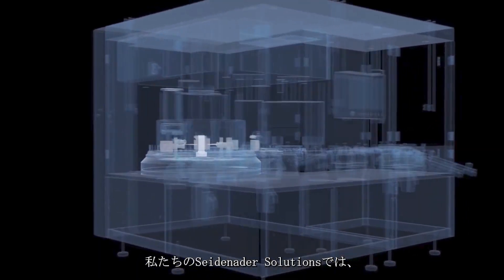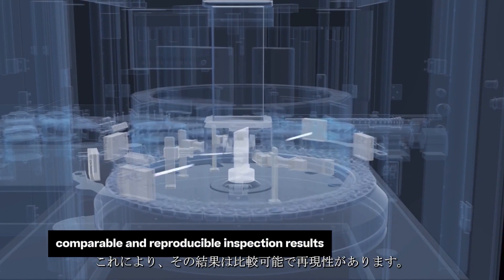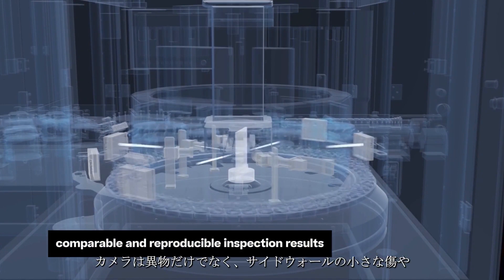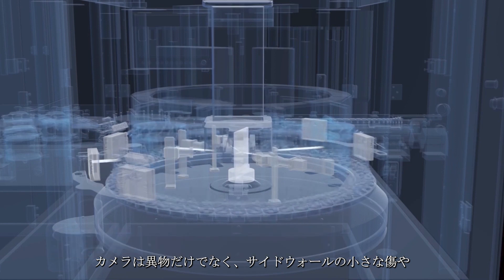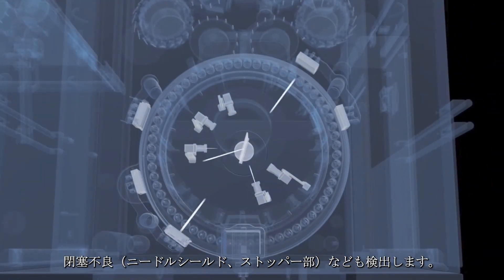In our Seidenader Solutions, each camera inspects each product, meaning the results are comparable and reproducible. Apart from particles, cameras also detect damages such as small scratches on a sidewall or closure defects.